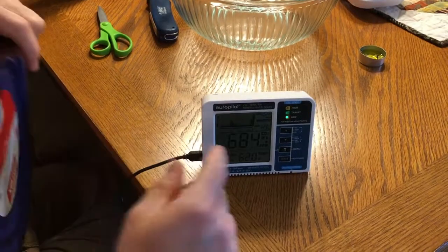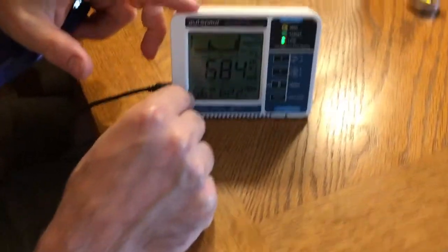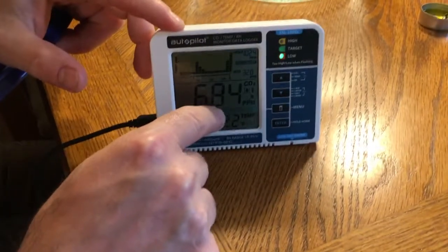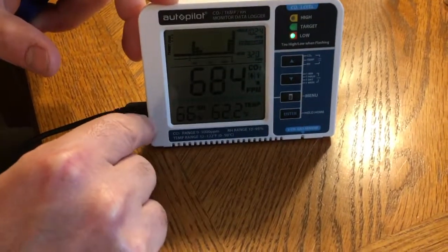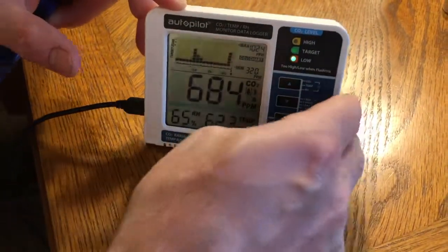First, its reading is — we can see it's at about 600 parts per million, 684 parts per million CO2. It's at 66% relative humidity, but it's not updating very often.